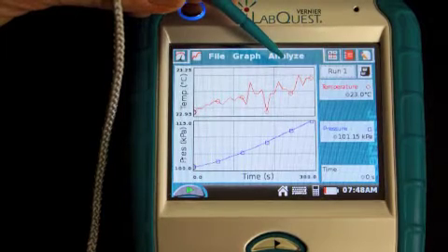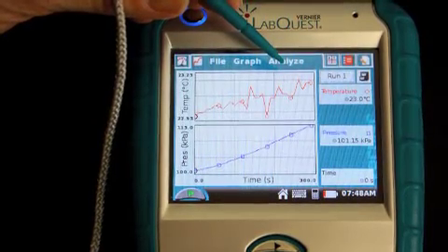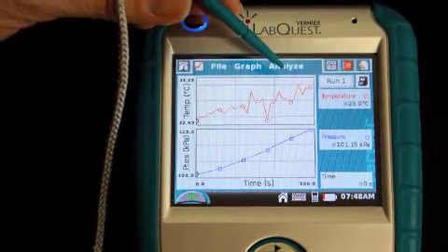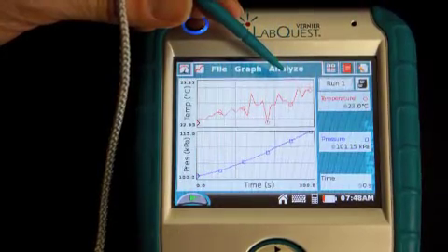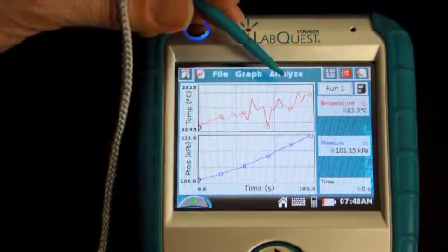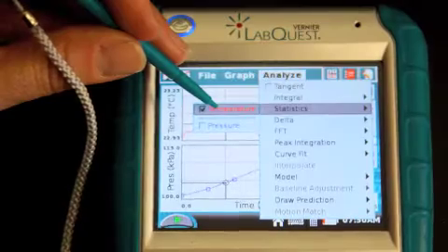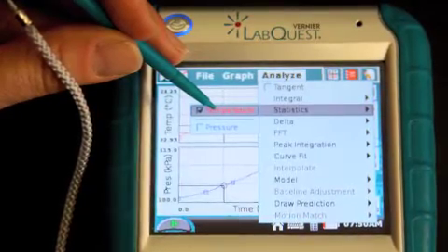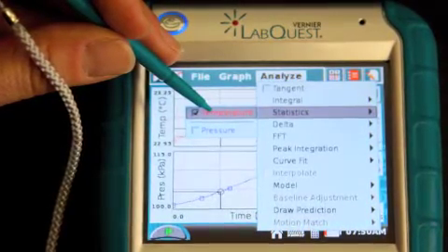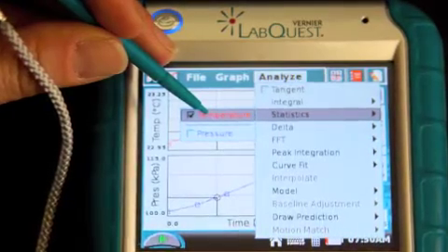Analyzing your data in a LabQuest is incredibly easy, which is one reason that it's such a great lab tool. First of all, we're going to figure out what the average temperature was over the 5-minute trial. And to do that, we're going to touch the Analyze button at the top of the graph menu and pull that down until we reach the Statistics and move your stylus to the left and choose temperature. That way you're choosing to view the statistics for just the temperature probe.